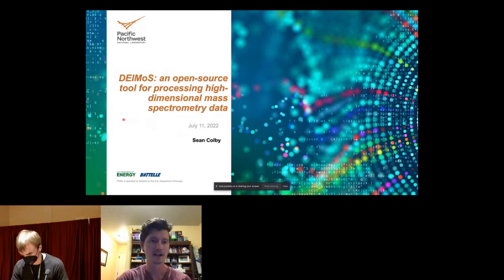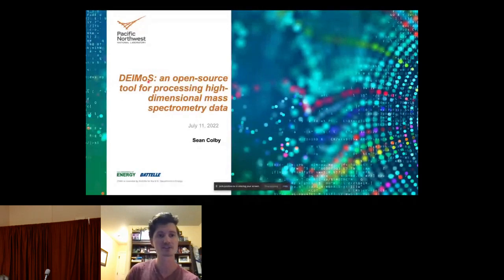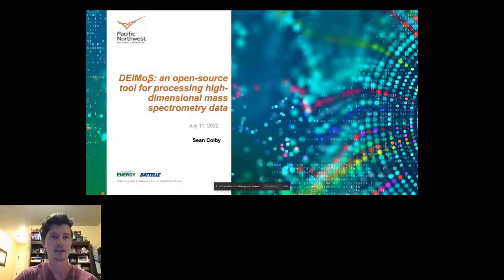I'm here to present on DEIMoS, or Data Extraction for Integrated Multidimensional Spectrometry. It's an open source tool for processing high-dimensional mass spec data.